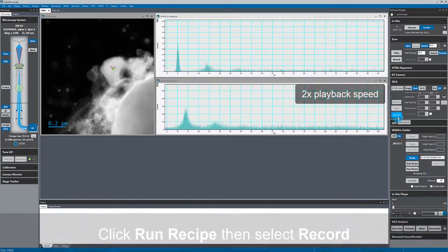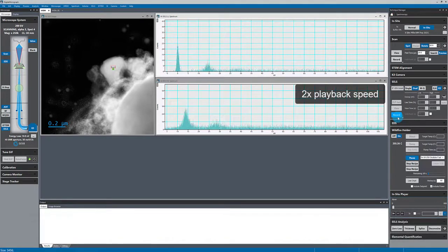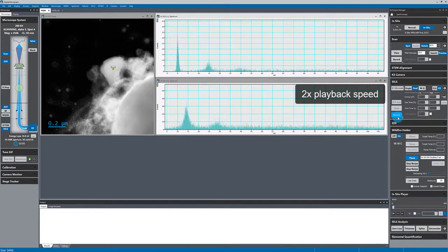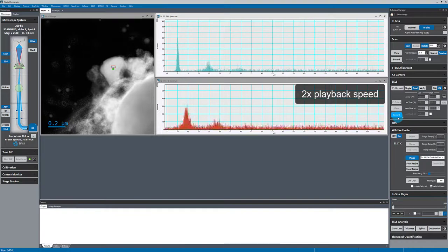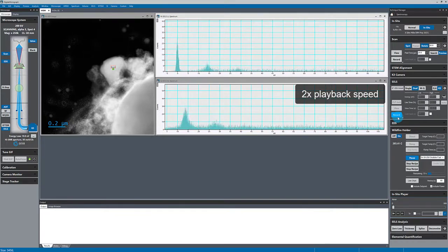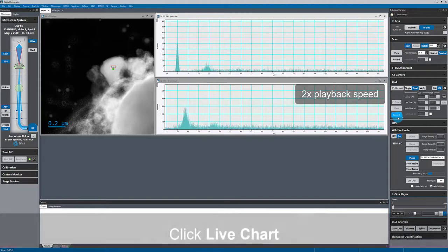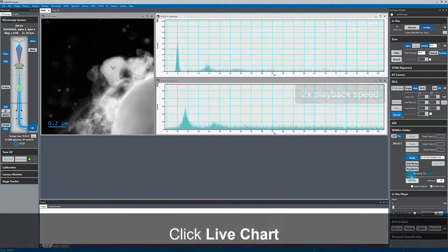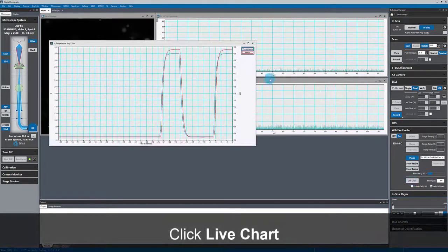Now it is recording in-situ EELS data continuously to disk, and it's also capturing the set and measured temperatures from the heating holder. I can also display that holder data in a live chart.